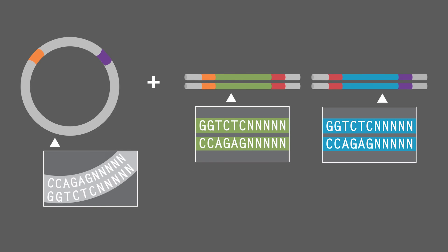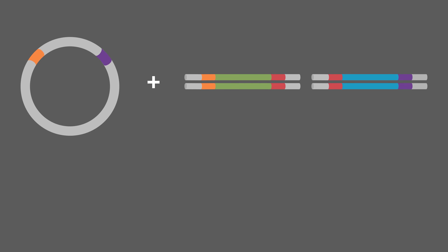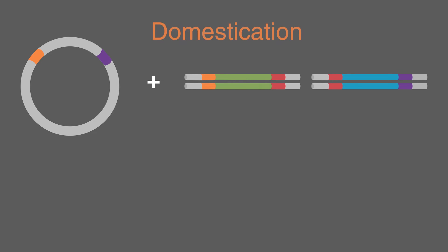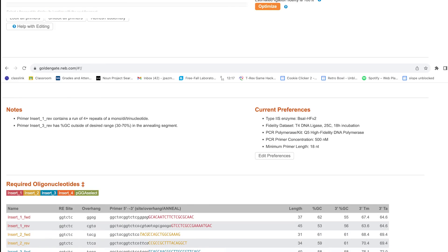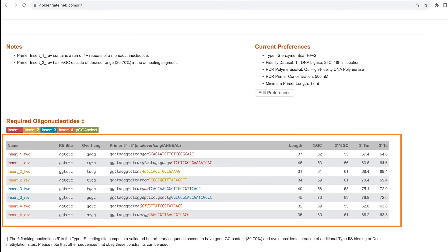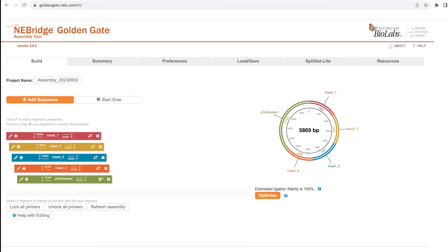These additional sites need to be removed for efficient assembly. This is a process called domestication. The tool provides primary recommendations to generate your fragment sequences via PCR — it appends the Type 2S binding sites to generate the required overhangs. Overhang sequences are selected to maximize the expected ligation fidelity of the assembly.